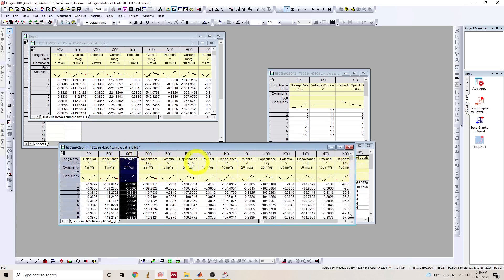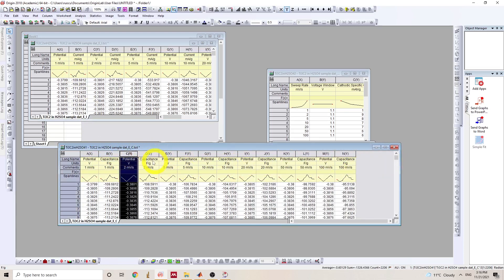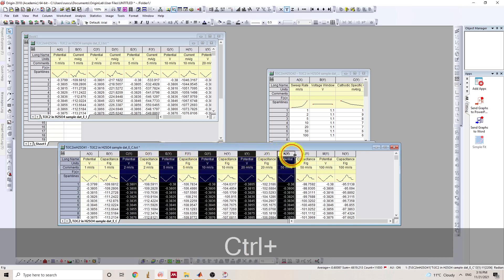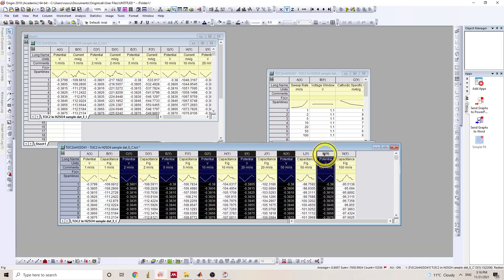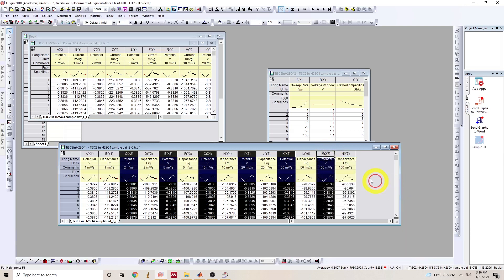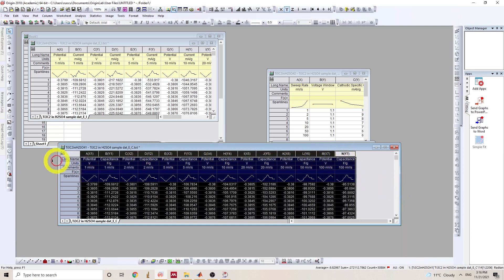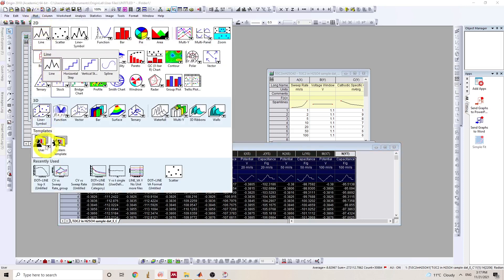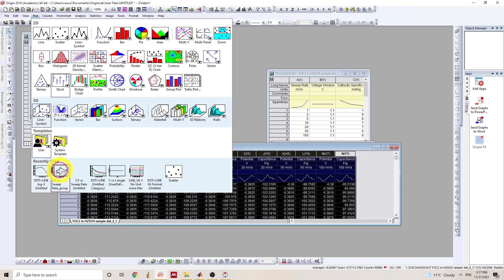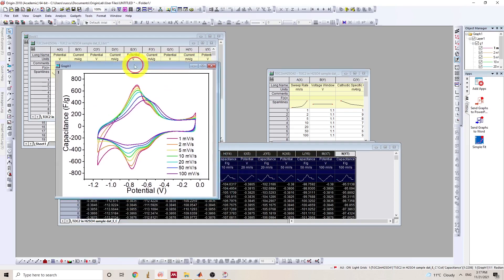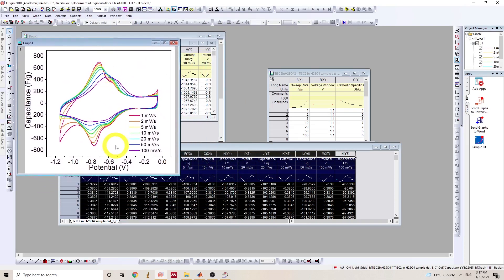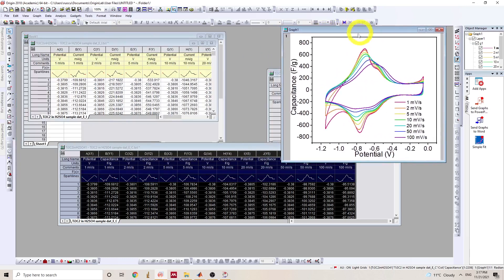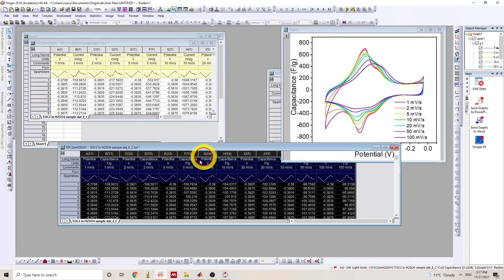So to plot them, I tend to change the potential column into x-axis and I'll group them and plot. Here we go. So these are the normalized capacitance as a function of potential. All right. So that's one graph.